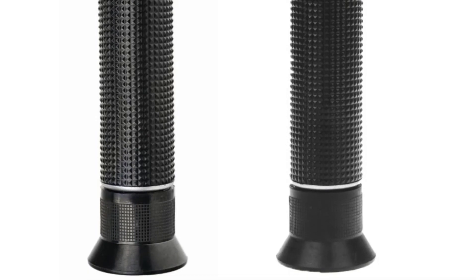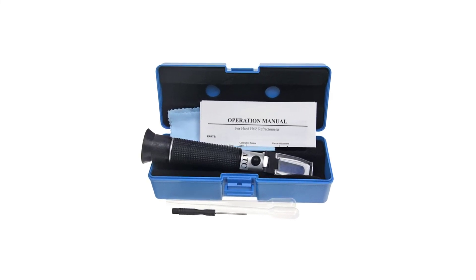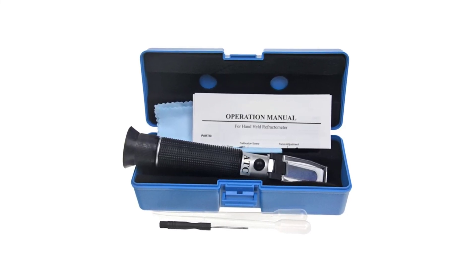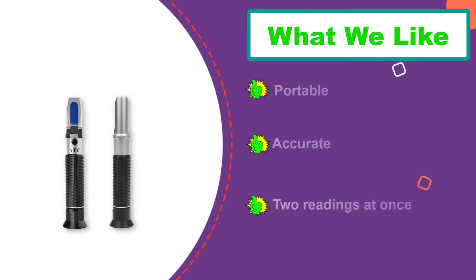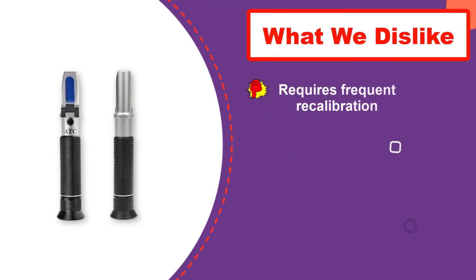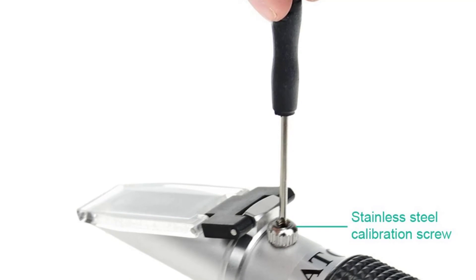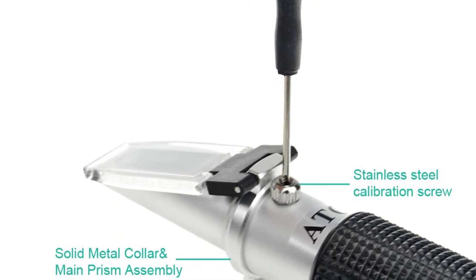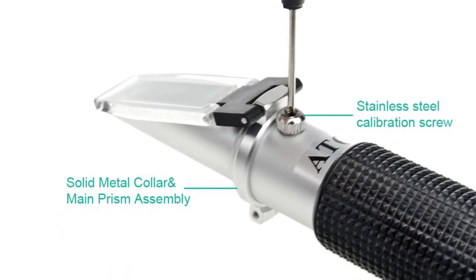For the long-term health and accuracy of your refractometer, clean your instrument immediately after getting your data. This refractometer provides two different sets of data — it measures specific gravity and parts per thousand as it relates to salinity. It is also able to read data points with very low salt concentration. Magnum's ATC technology — Automatic Temperature Compensation — means you can take this instrument in and out of different temperature ranges without having to calibrate it each time. Users are impressed by this inexpensive tool. While it requires more frequent calibration than other instruments, you do get bang for your buck, and the customer service team is responsive and friendly.